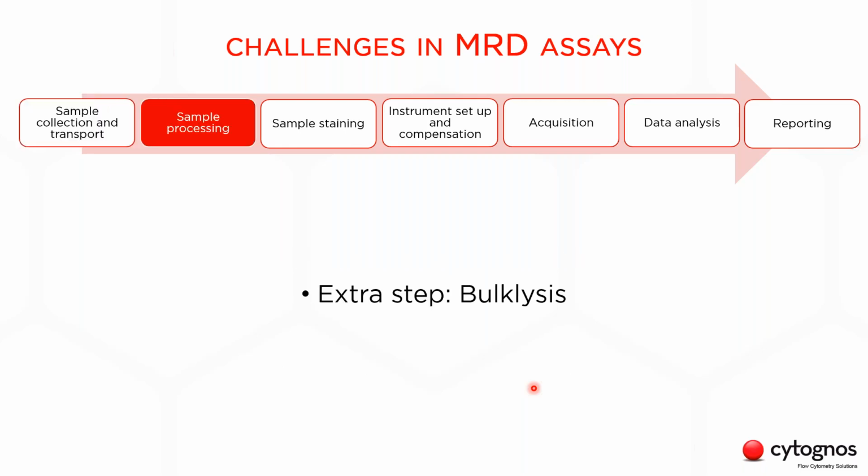In addition, when performing these studies, we need to achieve a very high sensitivity, and for that we have to bulk lyse the sample up front to concentrate the number of cells, so we need to add an extra step to our sample processing protocol.